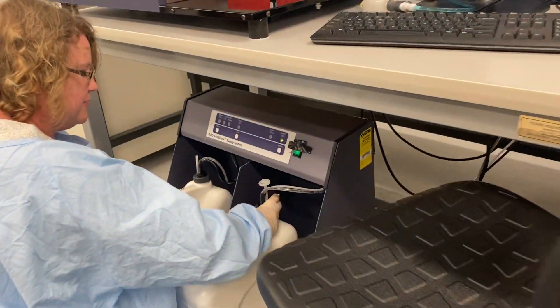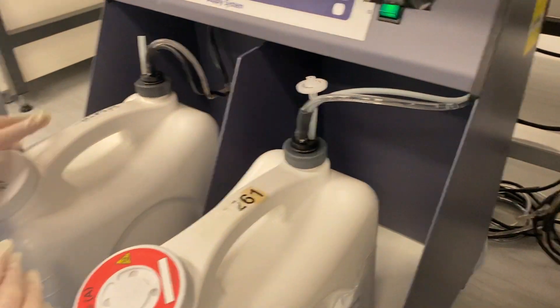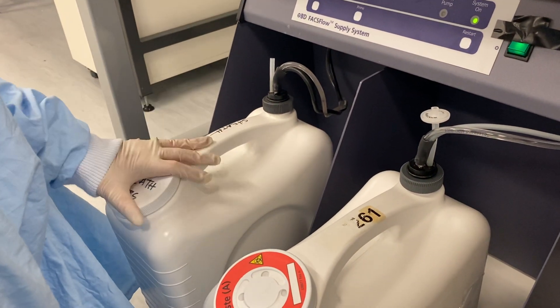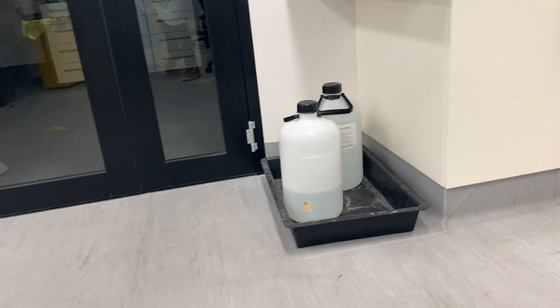Re-attach the sensor again and screw it in. Make sure that the sheath is full. If it's not full, you fill it up with the PBS that's in the 10-litre containers.